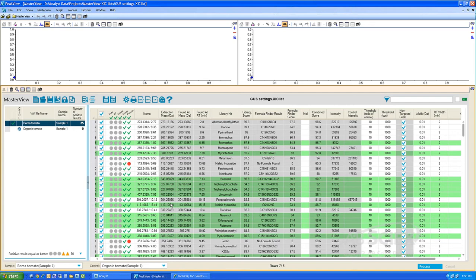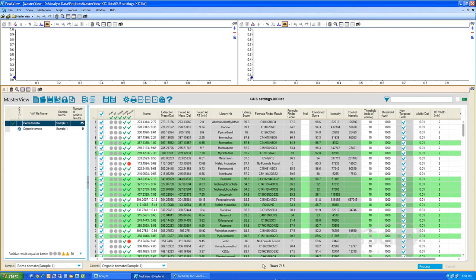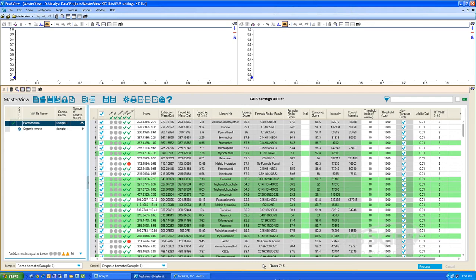After data processing is completed, we can see at the bottom that the software identified 715 chromatographic features in our unknown sample. By performing the comparison to our control sample, this number is reduced to 35 chromatographic features, which are present in our unknown sample at a higher level than in our control sample. This allows us to remove the healthy or normal peaks and just focus on those that are different and unique to our unknown sample.